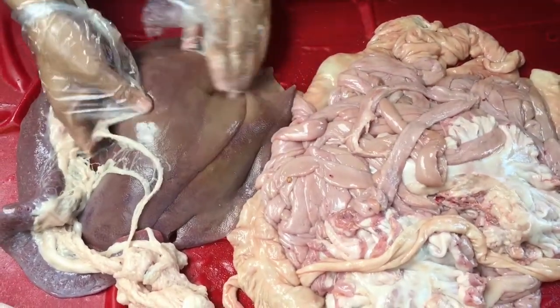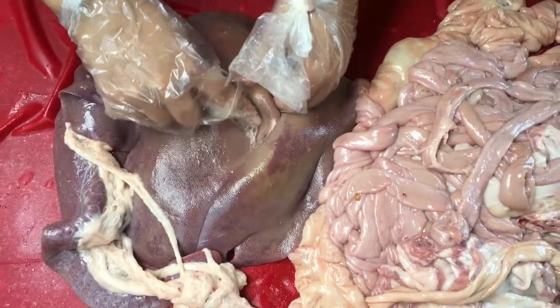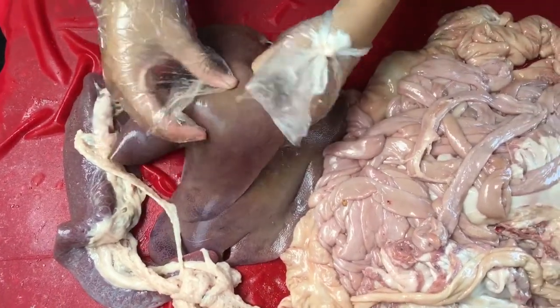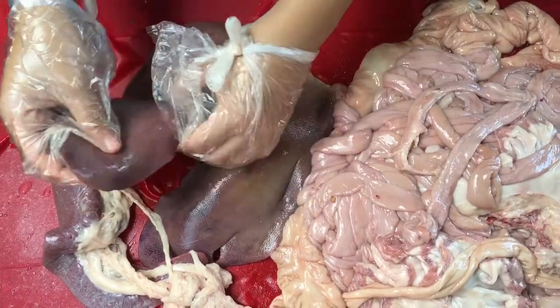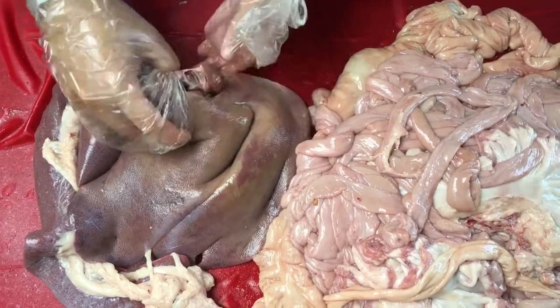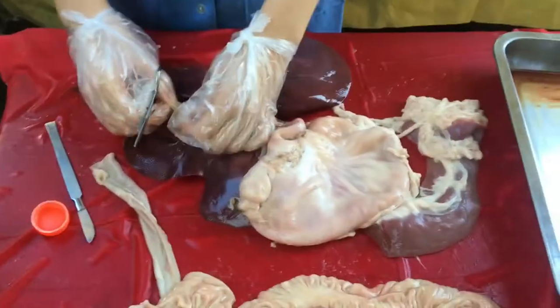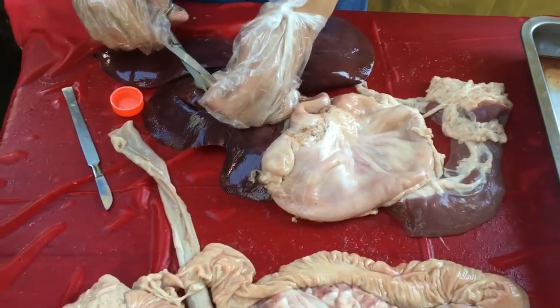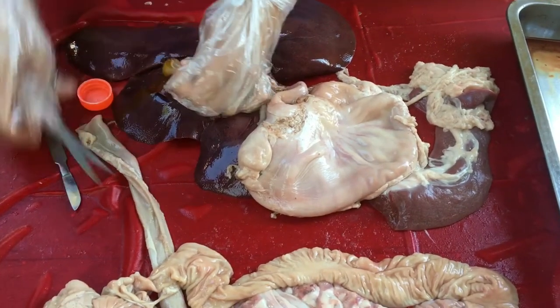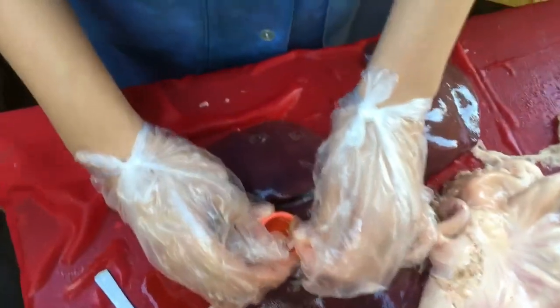There's a little bit of discoloration here, as you can see. The liver is a great place to look for any kinds of diseases or infections. And let's flip it. Here is where the main contributor to digestion from the liver is located. I'm going to open up the bile duct and express some of the bile into the tube so you can see what it looks like. This will pass into the duodenum and it helps with digestion.